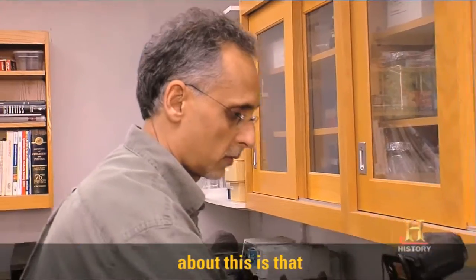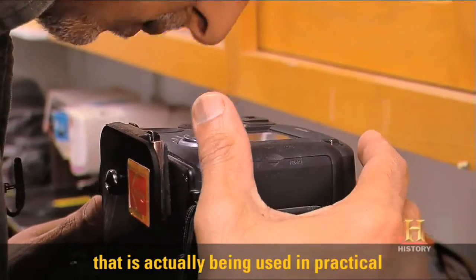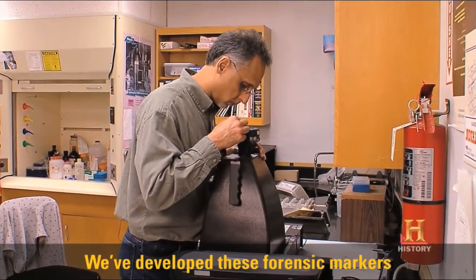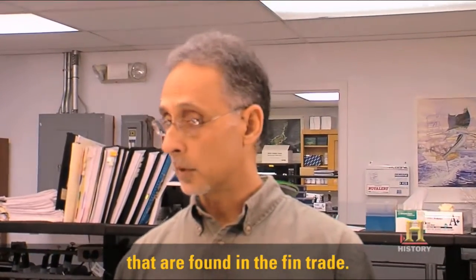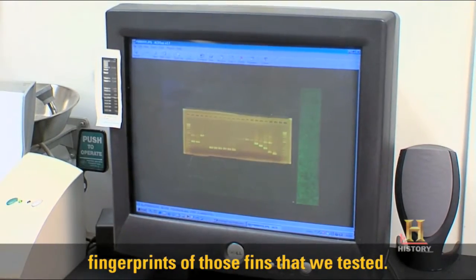What's really cool about this is that we've discovered a technique here that is actually being used in practical applications in law enforcement. We've developed these forensic markers to identify 30 shark species that are found in the fin trade. These bright bands represent the DNA fingerprints of those fins that we tested.